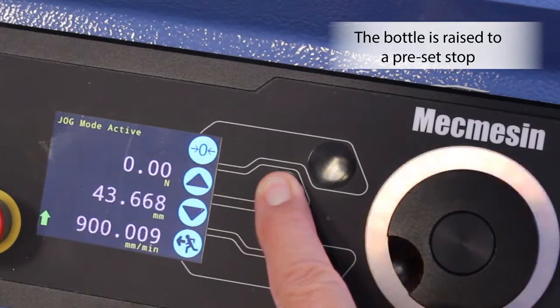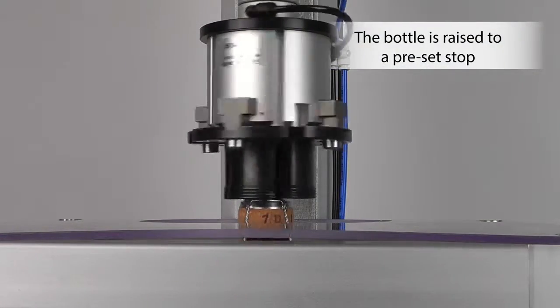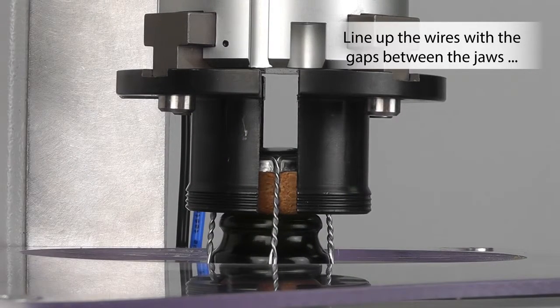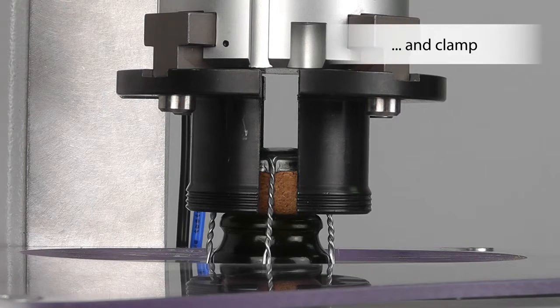The motor raises the bottle to a preset stop and the closure is then firmly clamped in the upper grip.